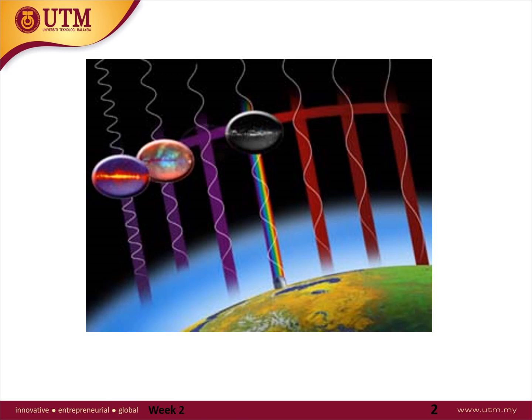You have to think about how, as I said before, we manipulate radiation from a certain source and bombard it onto our sample, and when the sample absorbs a certain amount of energy, it will transmit what's left. In instrumental analysis, we have certain mechanical parts inside our instrument that can act as the filter, as the detector, and so on.